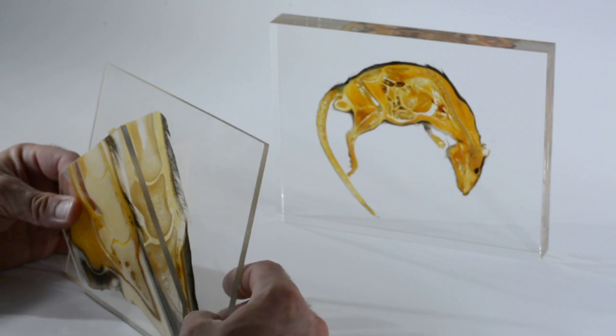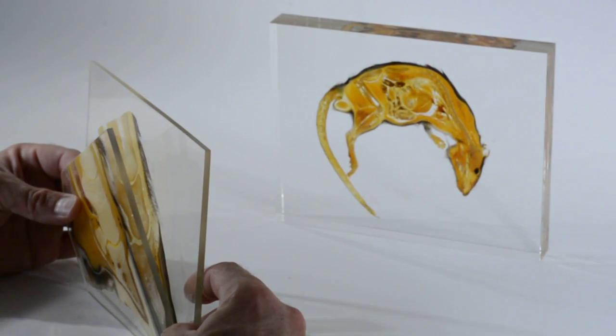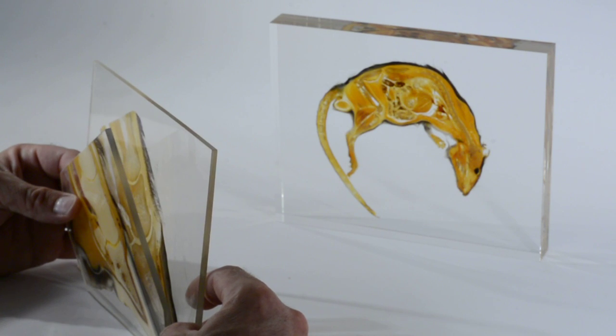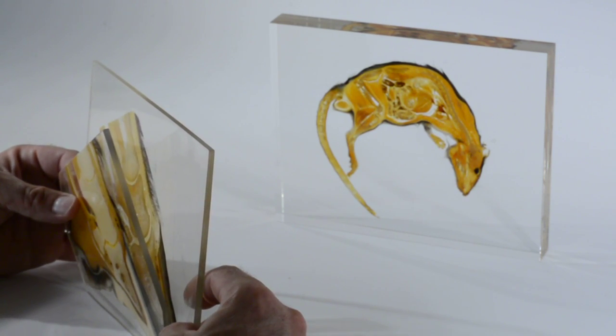This specimen or this technique is used mainly for exhibition purposes, for collections, or if you want it for decoration.